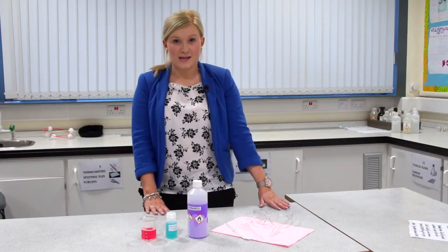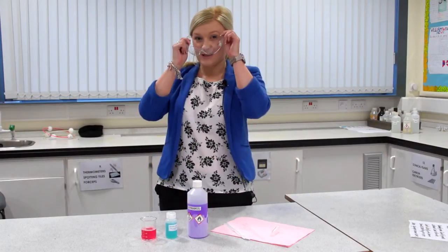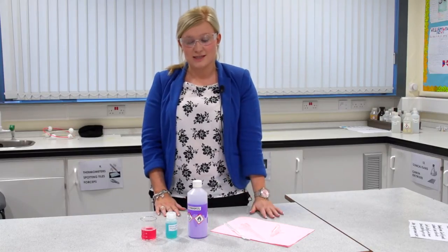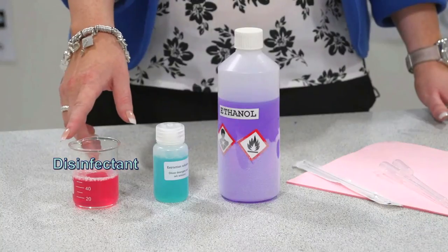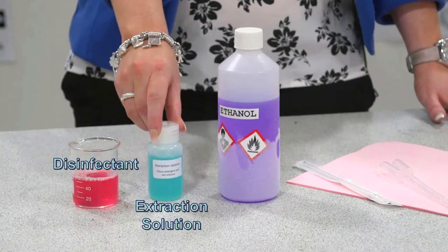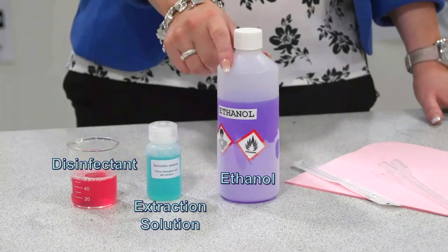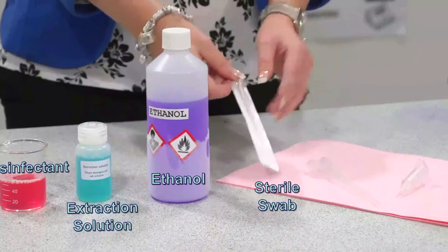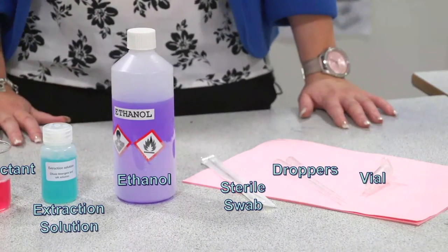Before you start your extraction of DNA, it's very important that you put your safety goggles on. Make sure that you've got all your solutions and apparatus ready: disinfectant so that you can dip your contaminated swab, extraction solution to help you extract the DNA, purple ice-cold ethanol, a sterile swab which comes in a plastic pouch, two droppers, and a vial to collect your DNA.